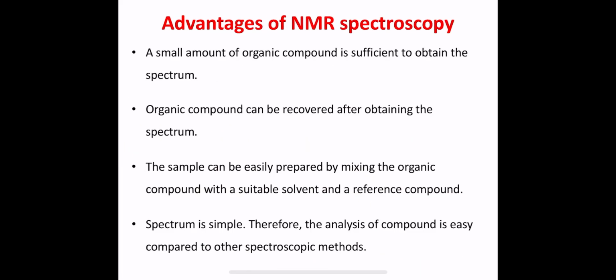And next, moving on to the advantages of NMR spectroscopy. So this is very important. Only when you know the applications or advantages of this particular spectroscopic technique can we implement it in the various studies we are going to take up in future, especially if we do any research, this NMR spectroscopy is very important. So that is why it is very essential to know about the advantages.